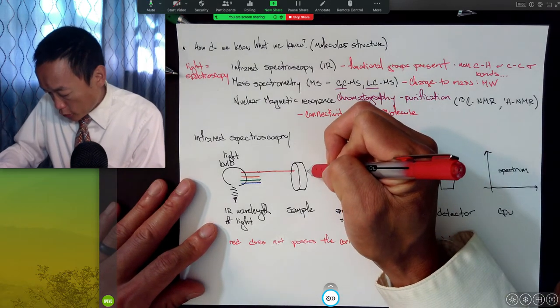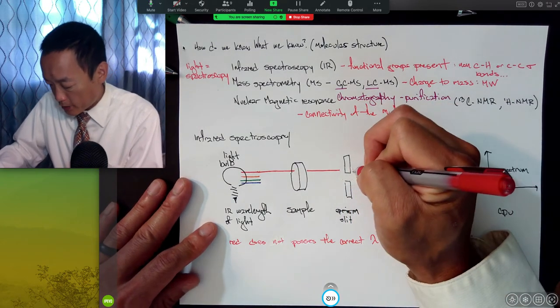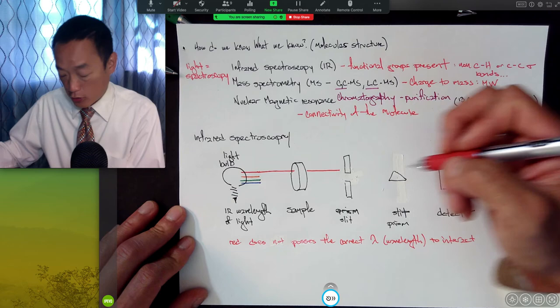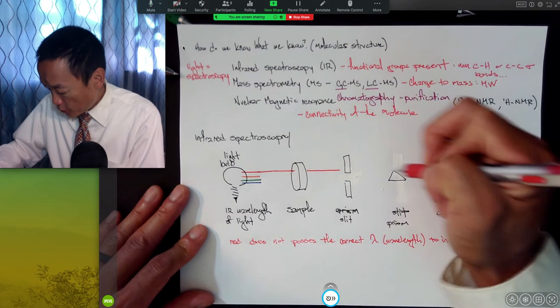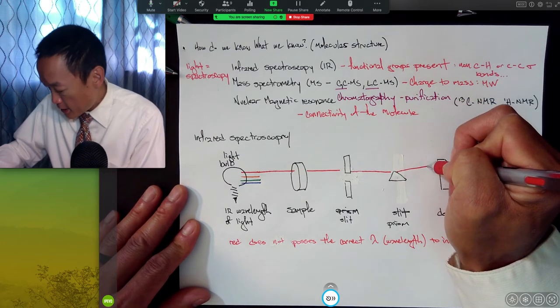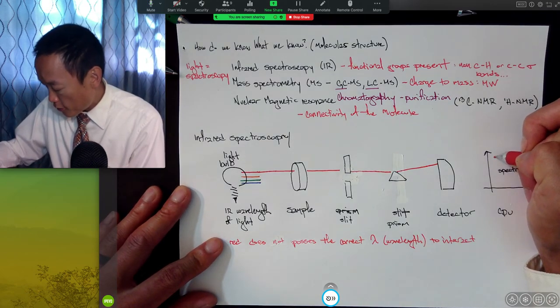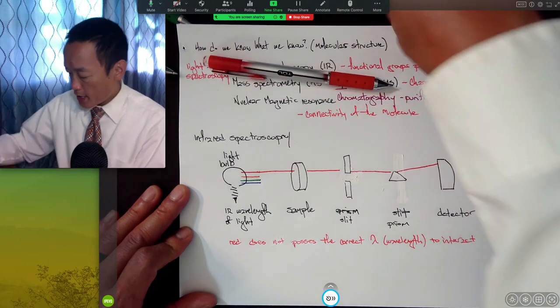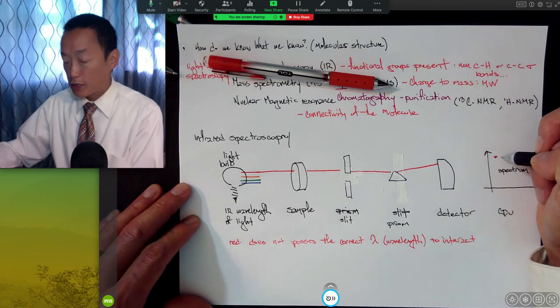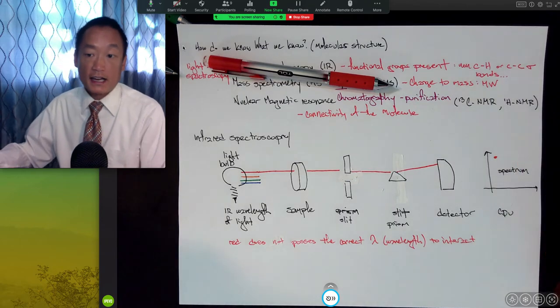So it goes through this sample, and the slit here isn't drawn so that I can show this passing through, but the slit reduces the total amount of light that the detector can see. So this whole thing passes through the slit, then the prism starts to deflect it, and it hits this detector, and all of a sudden it's going to show up somewhere on our spectrum. I'll come back and define the Y and the X axis in just a second.